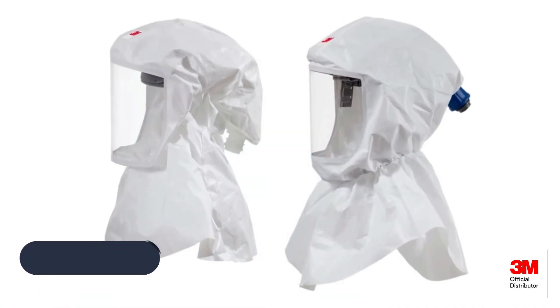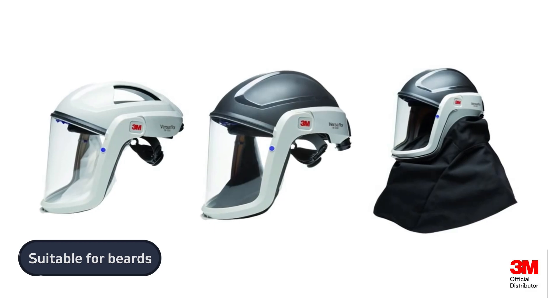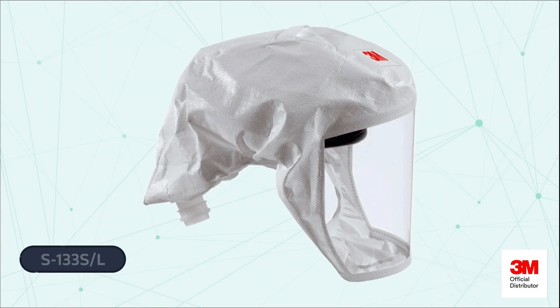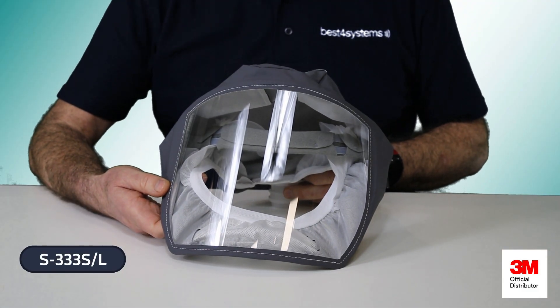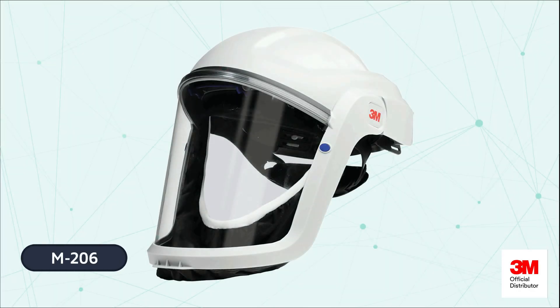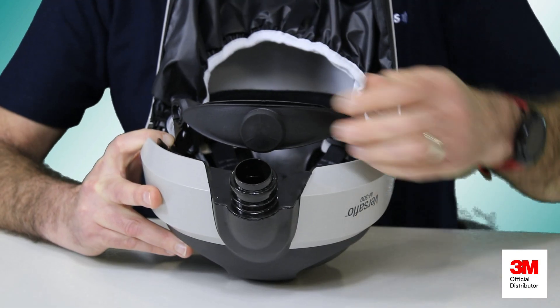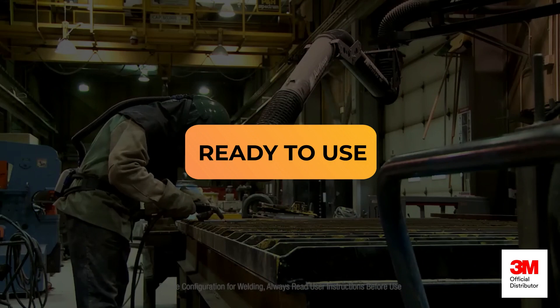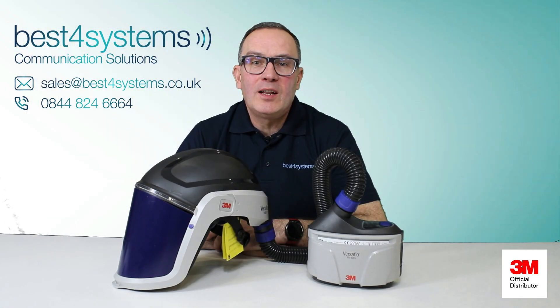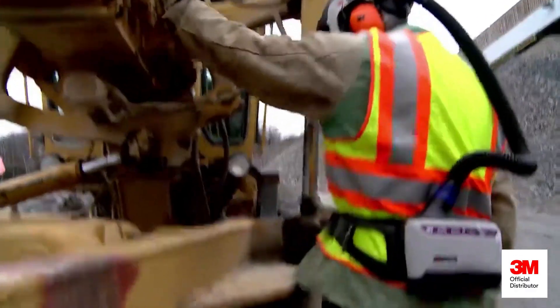With the Versaflow system, you do not require a face fit test and you do not need to be clean shaven like you do with the regular FFP3 mask. A fabric head top such as the S133L is ideal for the healthcare industry. There is also the S333L which utilises a fabric design which is wipeable. If there is danger of you bumping your head whilst at work, it may be worth considering the M206 helmet, or taking it to the next level of protection with the M306, which will give you hard hat level protection. The helmet size is also fully adjustable using a dial. Once you've connected your choice of head top via the breathing tube, you're good to go. It's an easy to use, ideal solution for protecting against fine dust and pathogens.